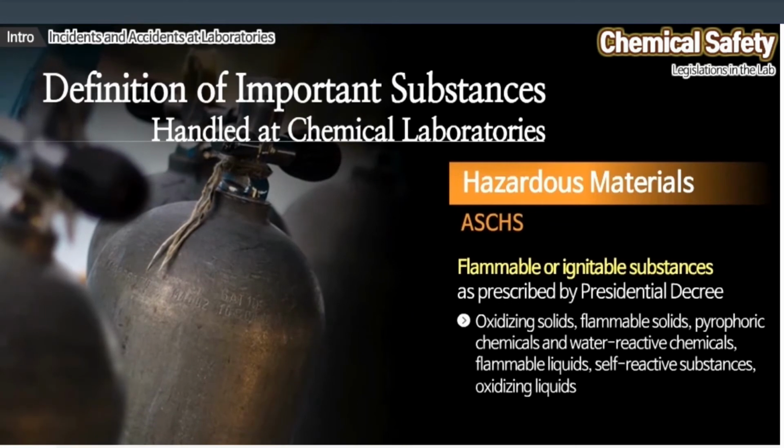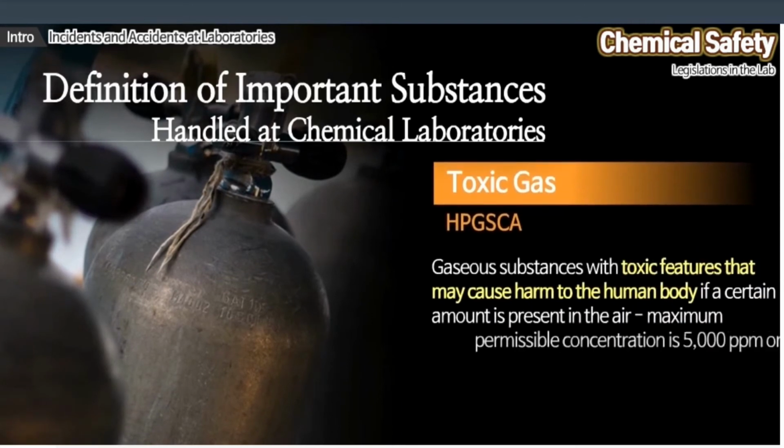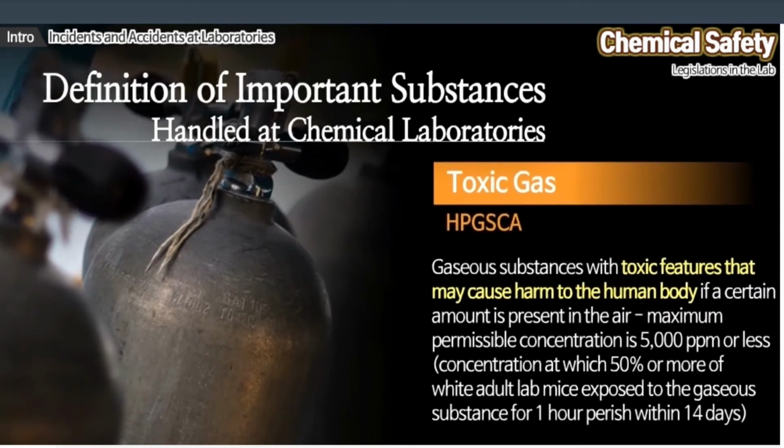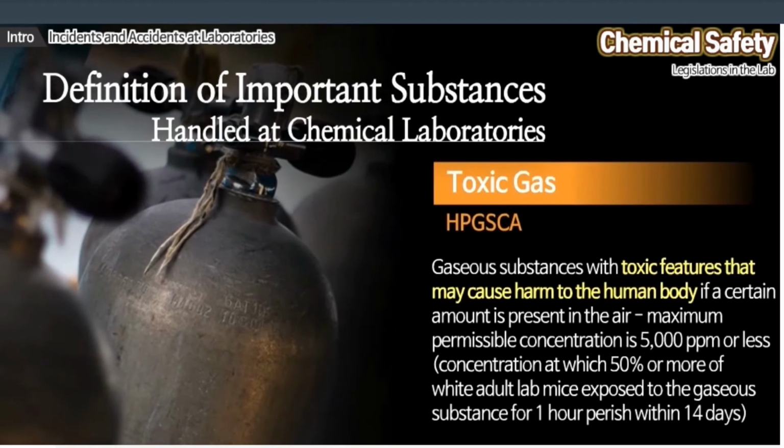are considered hazardous materials. Toxic gas, as defined under the High Pressure Gas Safety Control Act, refers to gaseous substances with toxic features that may cause harm to the human body if a certain amount is present in the air. More specifically, toxic gases have a maximum permissible concentration of 5,000 ppm or less. If 50% or more of white adult lab mice exposed to the gaseous substance for 1 hour perish within 14 days at this concentration, the substance is regarded as toxic.